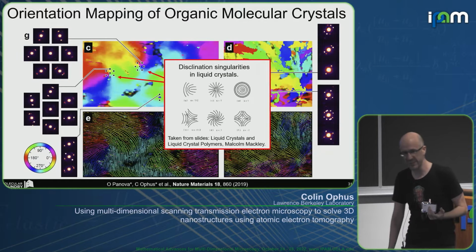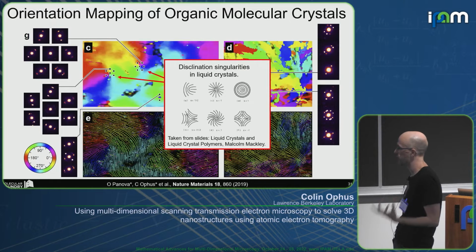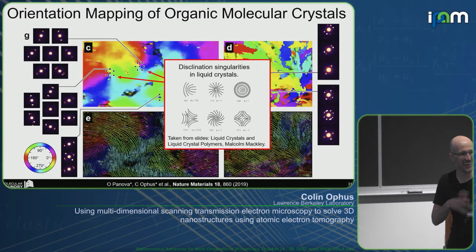And you actually mostly see these in liquid crystals. So I thought they were really cool to observe here in a polymer-like sample. And we're applying this method for many, many other soft matter types of samples. Maybe Andy will talk about that later this week.